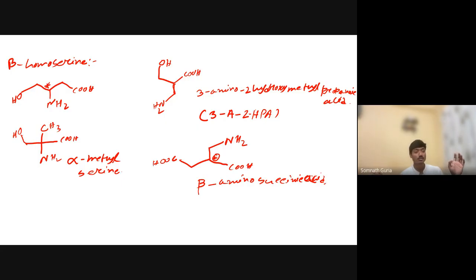Is our light chiral? Otherwise, you cannot distinguish the chiral molecules, because the chemical and physical properties of two enantiomers are similar.